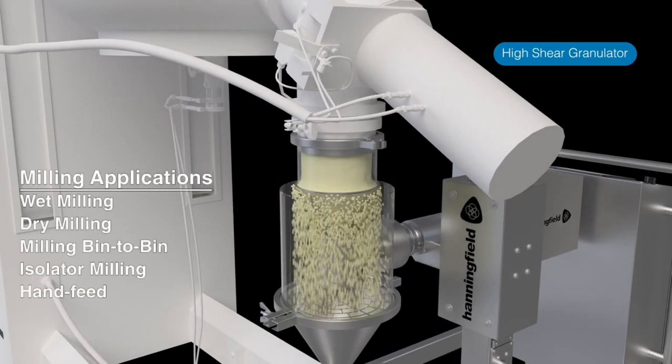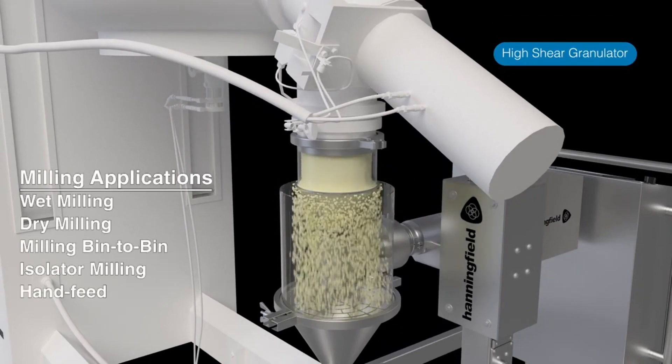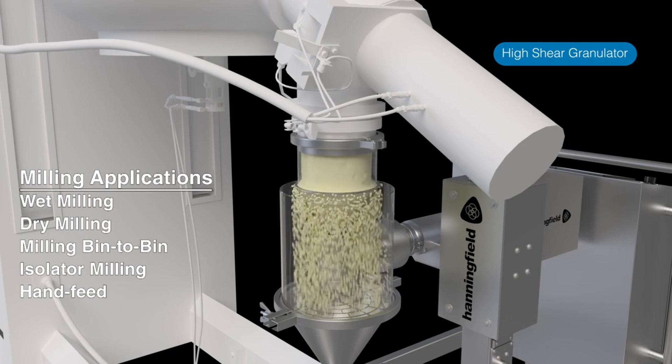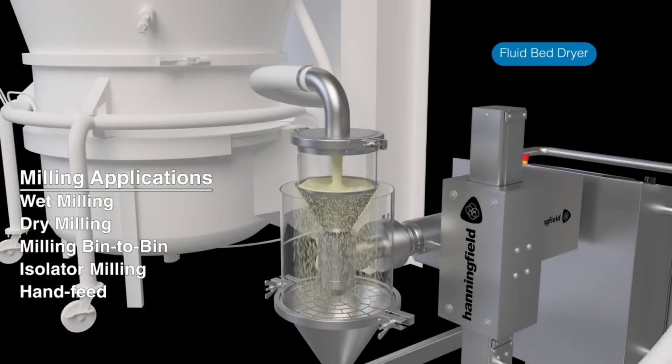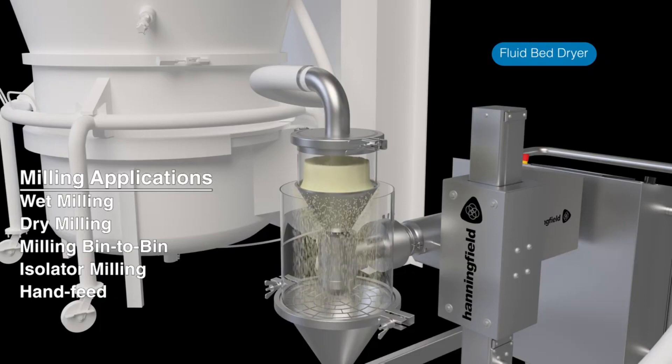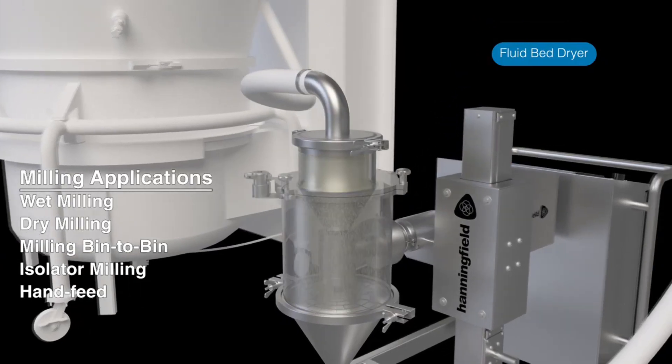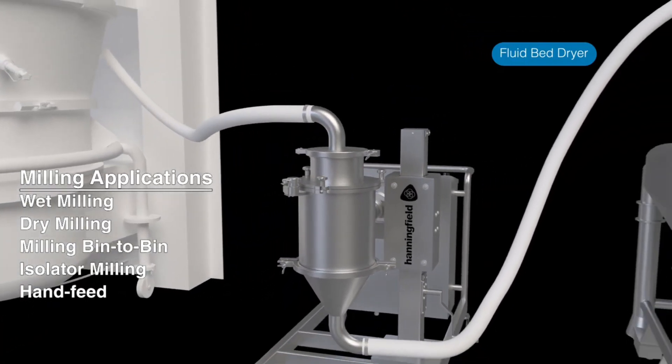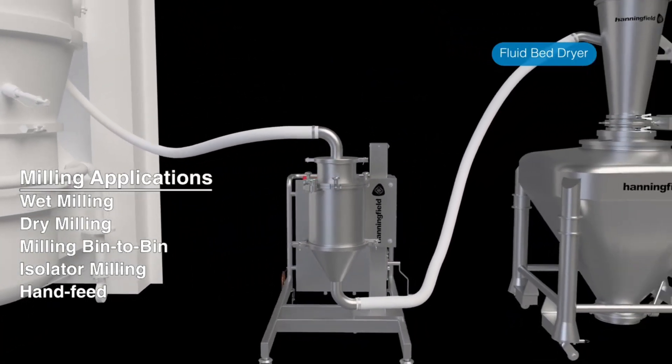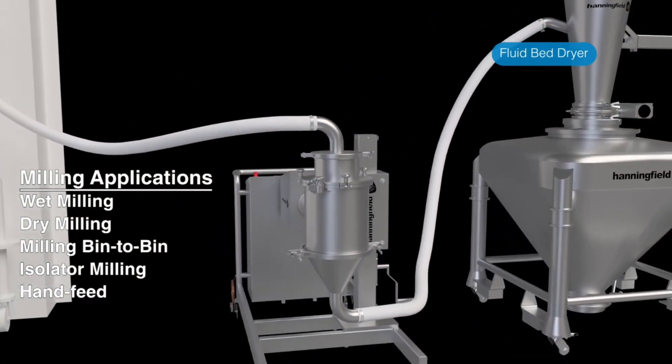Typical conical milling applications include wet milling from a granulator or high-shear mixer which creates a smaller, more uniform particle for faster drying in a dryer. And after drying, where a conical mill is used again to de-lump material and provide a desirable particle size distribution for downstream compression or encapsulation.